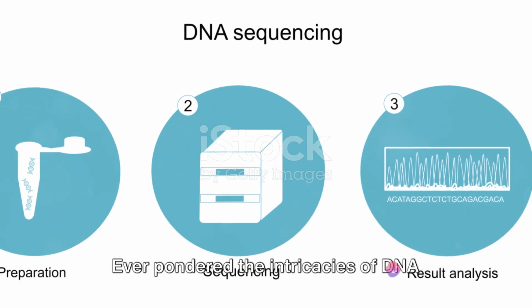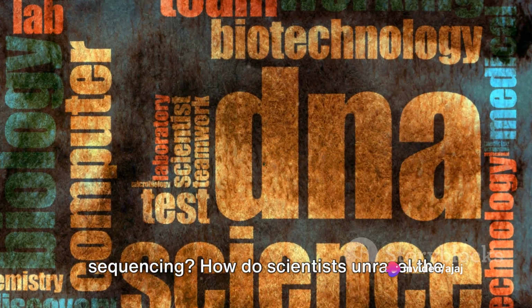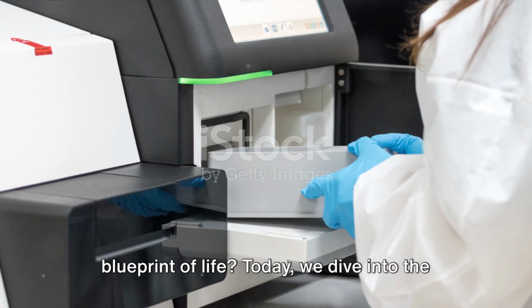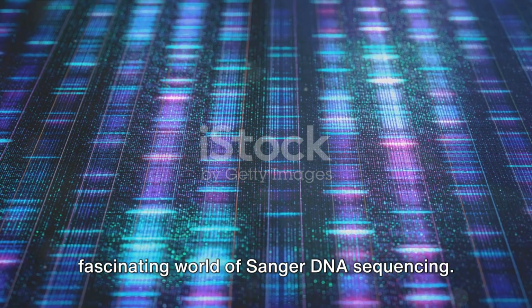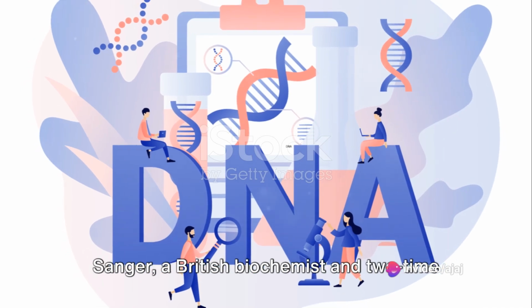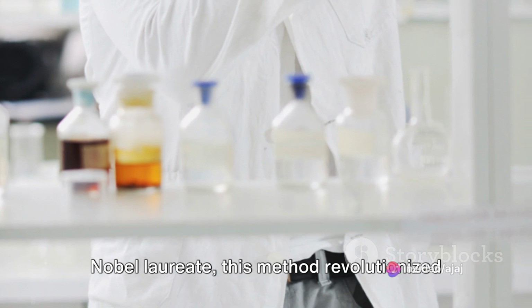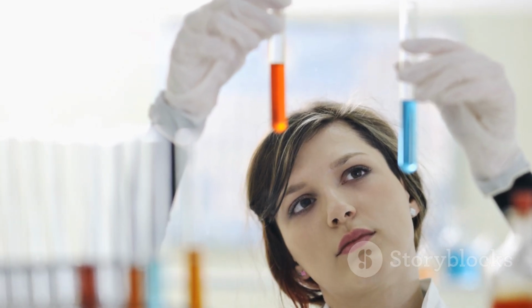Ever pondered the intricacies of DNA sequencing? How do scientists unravel the secrets locked within the DNA, the blueprint of life? Today, we dive into the fascinating world of Sanger DNA sequencing. Named after its developer, Frederick Sanger, a British biochemist and two-time Nobel laureate, this method revolutionized the field of genetics when it was introduced in the late 70s.